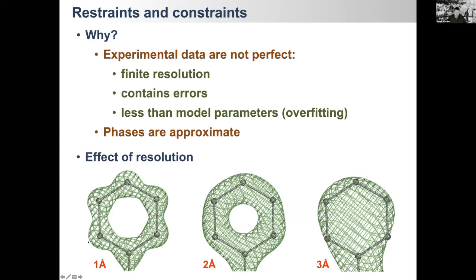So there are peaks here, you know exactly where the atoms are. It's all obvious, all good. In contrast, in this scenario, you kind of know where the side chain is, right? So that's the blob, that's where the side chain belongs to, but if you ask where this particular atom needs to be, you won't be able to tell just based on the map. It can be here, it can be here, it can be there, it can be anywhere. The map doesn't tell you where it is.